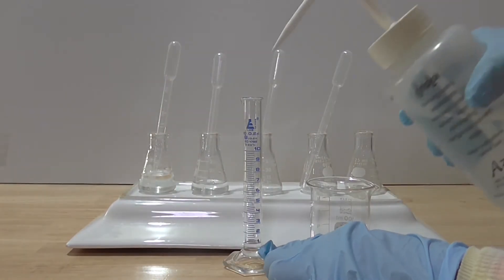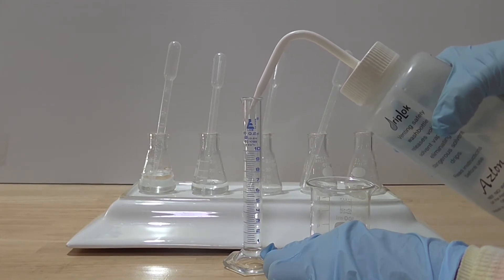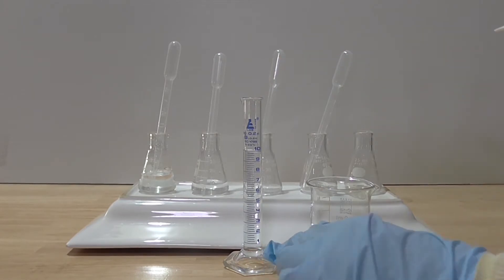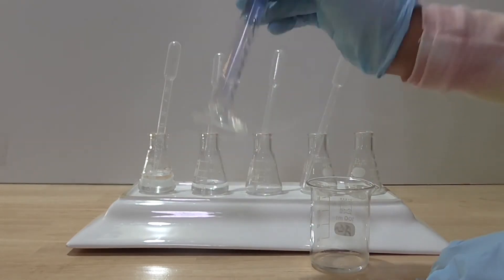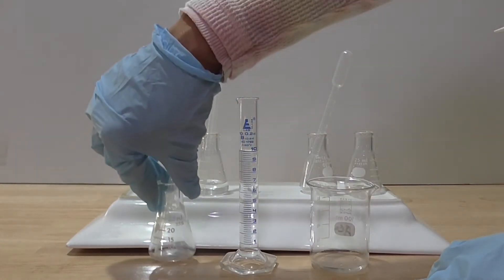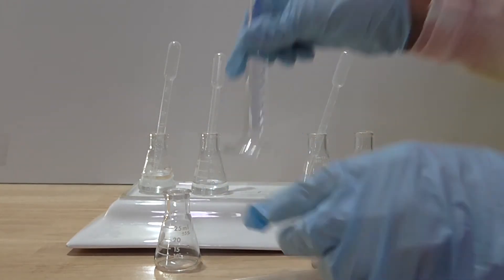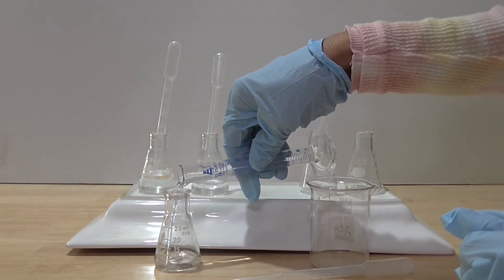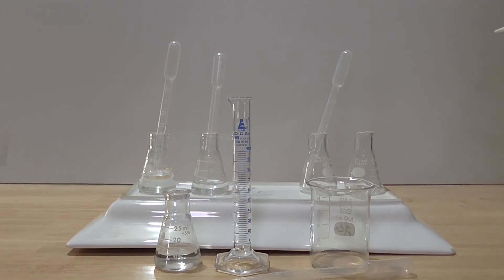Then I pour nine milliliters of water into the cylinder. I ensure the solution is well mixed. The sodium hydroxide in the measuring cylinder now has a concentration of 0.01 molar. I pour the 0.01 molar sodium hydroxide into a clean dry glass flask.